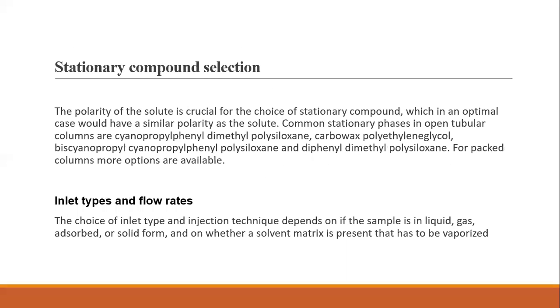Let's move on to the next method, which is stationary compound selection. In this method, polarity of the solute is crucial for the choice of stationary compound. An optimal case would have a similar polarity as the solute.